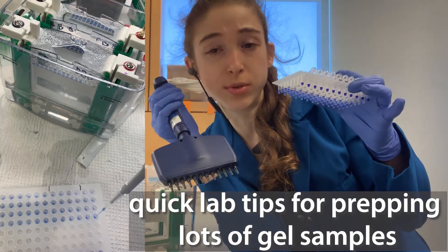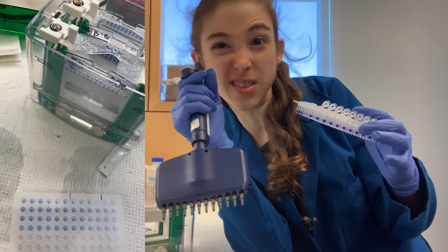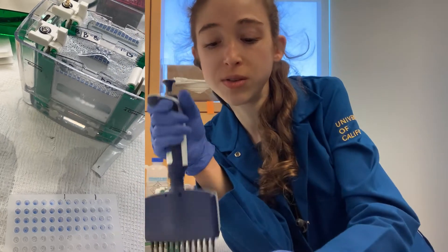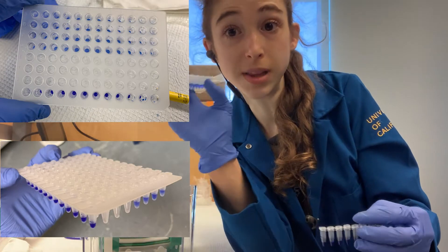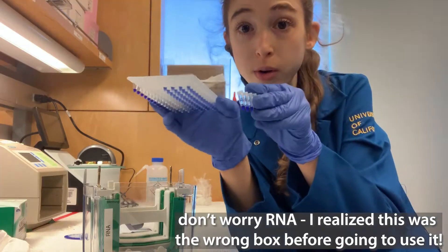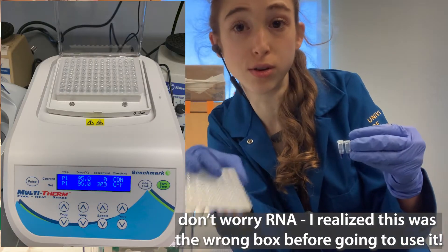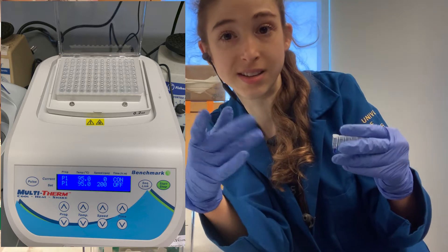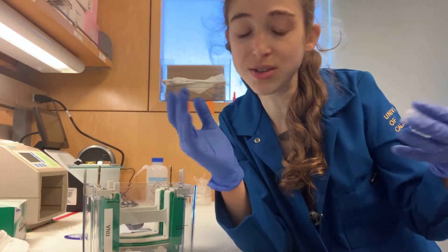I have a lot of SDS-PAGE samples to run. A tip when you have a lot of samples is instead of preparing them in individual Eppendorf tubes, you can prepare them in PCR strips or a PCR plate if you have a lot. Then you can actually just boil this, heat it up in your PCR machine or a thermal shaker block that can hold a PCR plate, and then you can do your thing.